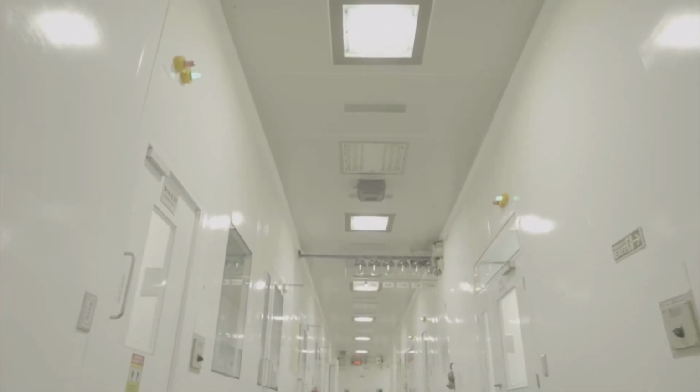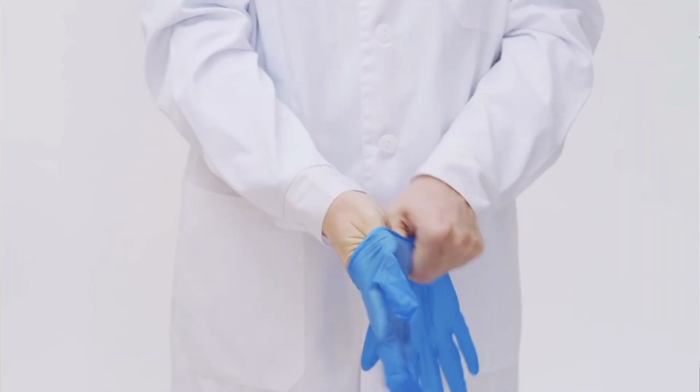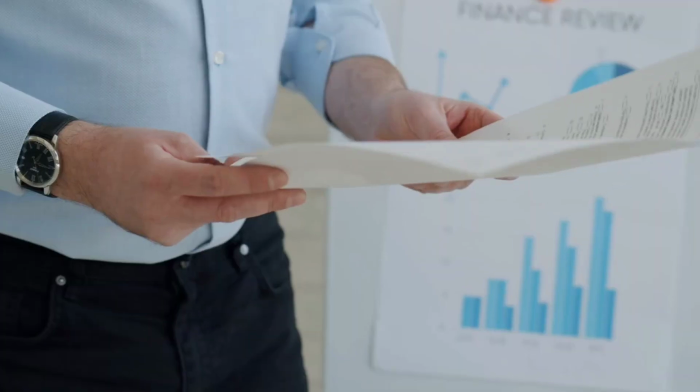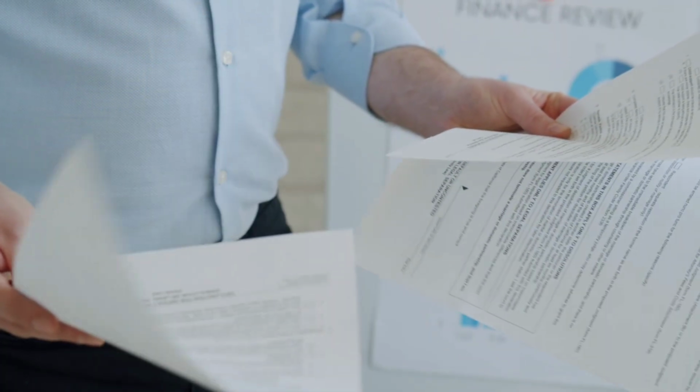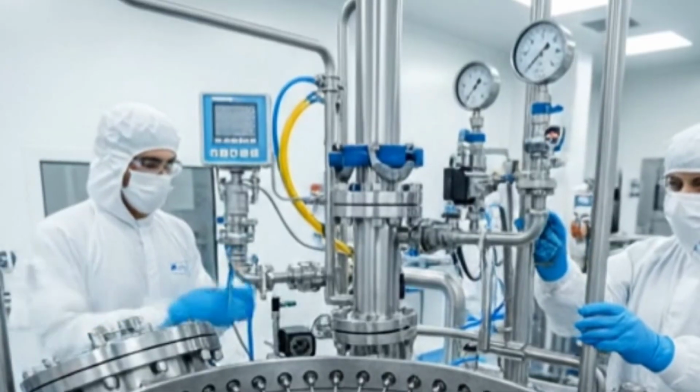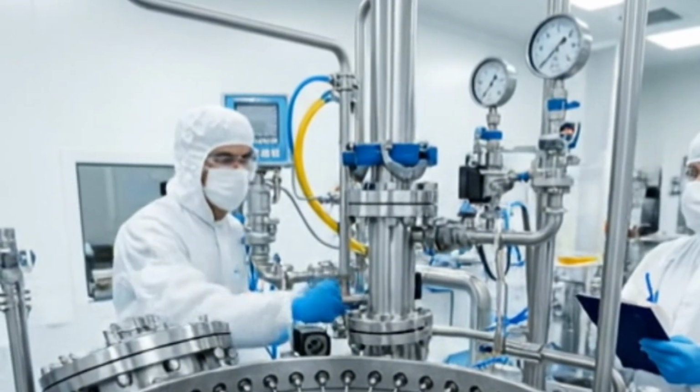The next important process is gowning qualification. All personnel who are involved in aseptic activities and manufacturing should complete their gowning qualification and must be trained for aseptic activities. Their training record should be reviewed and confirmed by the user department and at the same time by QA. So only authorized personnel are allowed to enter the clean room or participate in aseptic activities.